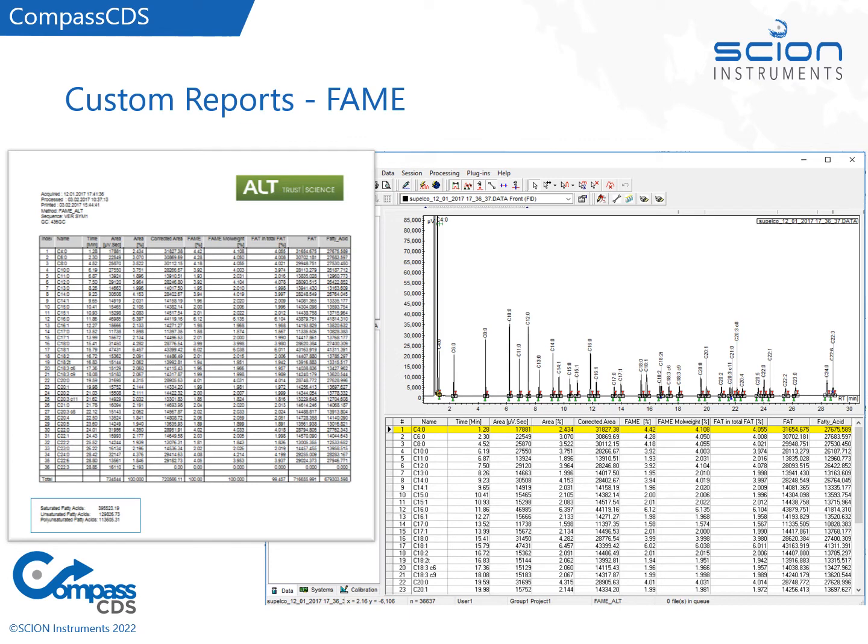Within CompassCDS, you also have the ability to customize reports. The software is provided with various different template reports, such as a calibration report, a method report, or a very basic chromatogram and results table report per injection. On the screen here, you can see a custom report, which is a FAME report. FAMEs are fatty acid methyl esters, which are found in food oils. This would be a standard customized report.